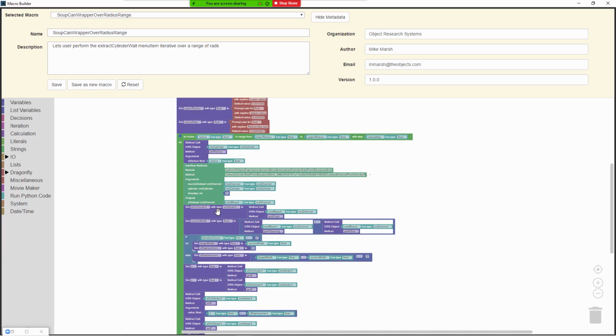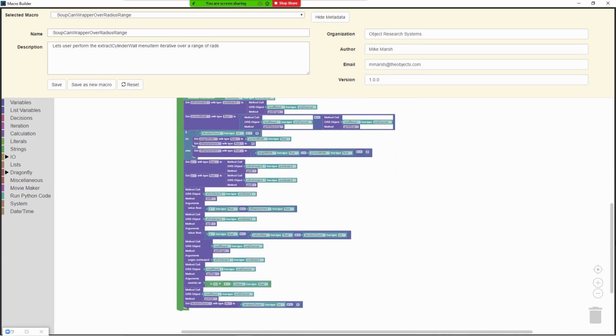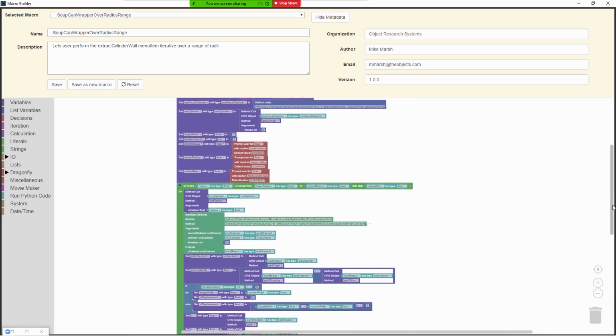Then I do some bookkeeping. I inspect the pixel size and the width of the images so I can do the proper displacement of the images laterally and in Z. And then I publish all of the images. So all of that's spelled out here.